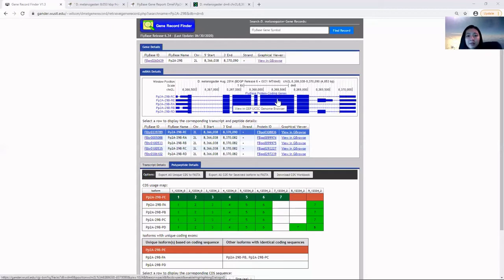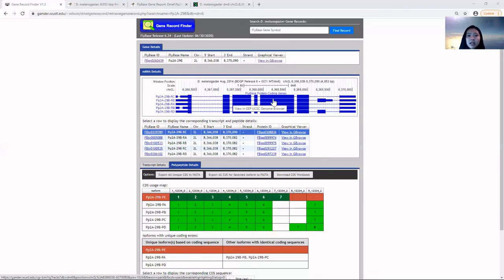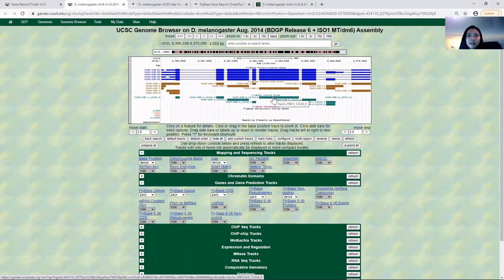If we click on the FlyBase protein coding genes track containing the mRNA details, it will take us to the genome browser of the gene in D. melanogaster. So let's click on that, and here we go.